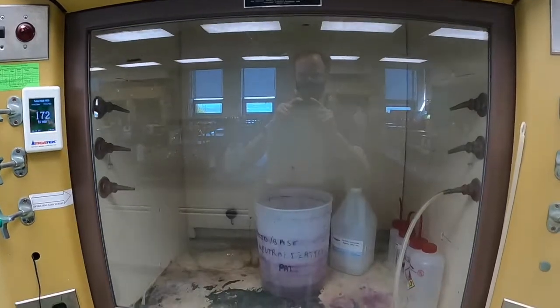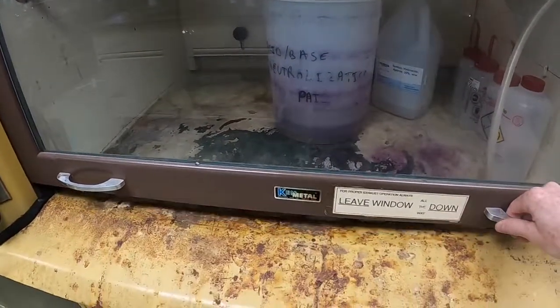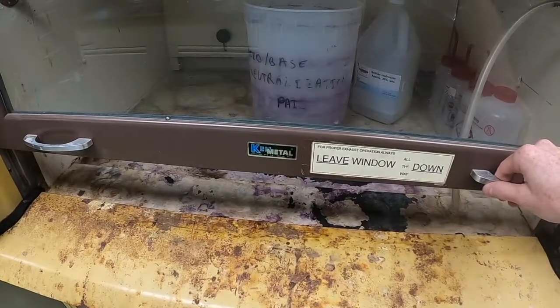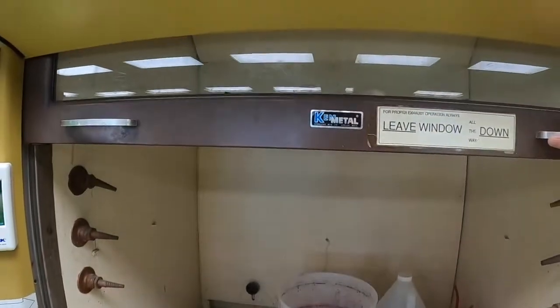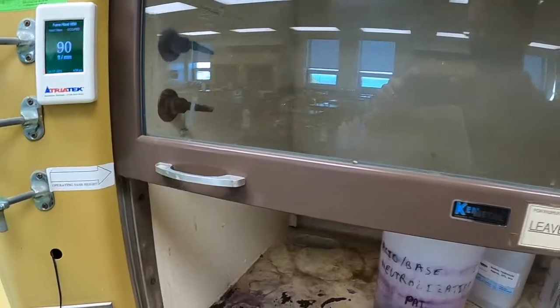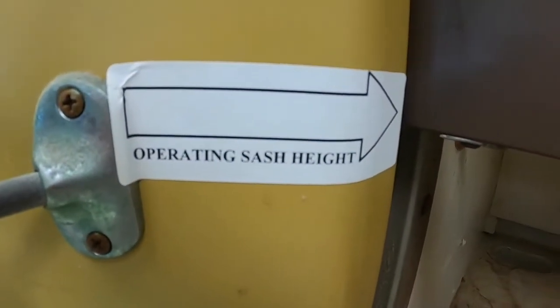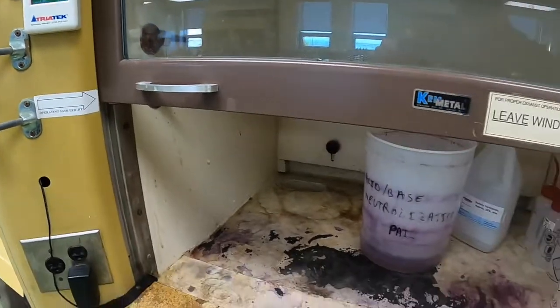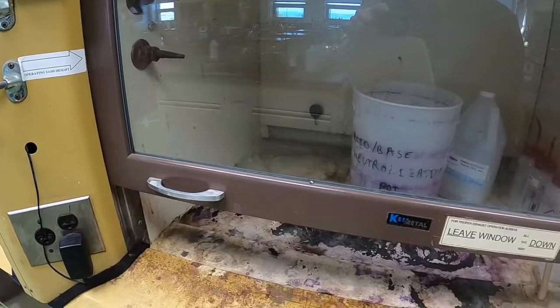If the gauge shows red, you shouldn't use the fume hood. When you use a fume hood, you always want to leave the window down as low as possible. When you raise the window too high, you can lower the airflow rate to the point where the fume hood no longer operates effectively. On the side of the fume hood, there's an indicator that shows the maximum height the window should be raised to. In general, the window should be kept at a much lower height and should be closed when not in use.